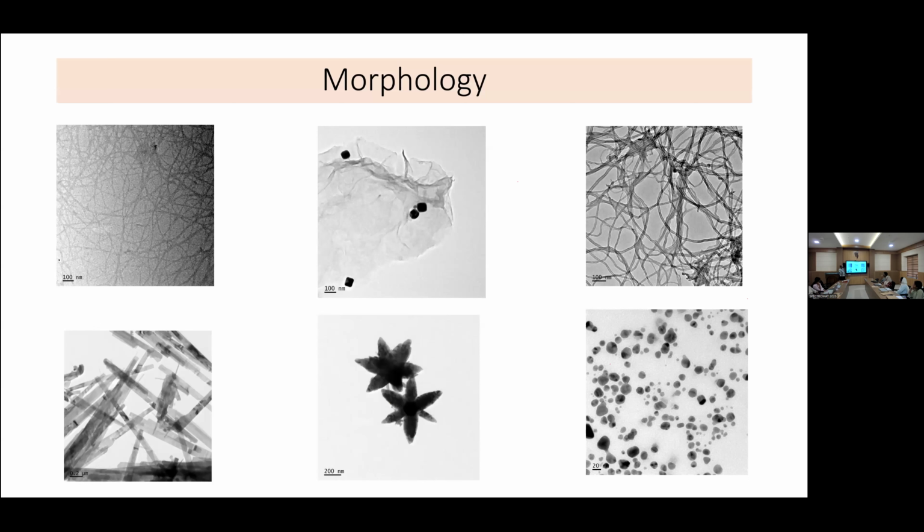Then these are some of the morphologies. This is the rod morphology. One more important thing, you should take care about the scale. Most of the people, sometimes they say, oh, here this is 100 nanometer, so our particle size is 100 nanometer. It's not like that. This is the scale, so this is just for reference. Like here it is 200 nanometer. The length of this line is 200 nanometer. Wherever you measure, it's 200 nanometer. So that is the thing.